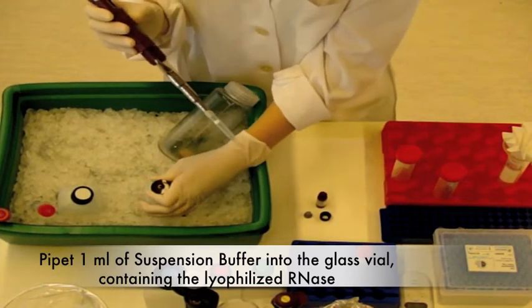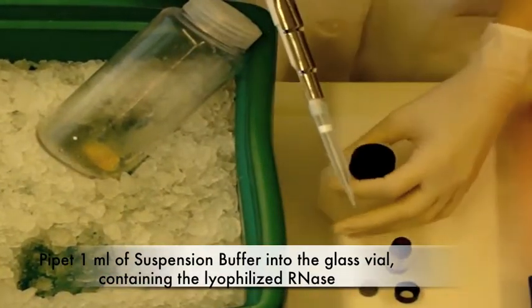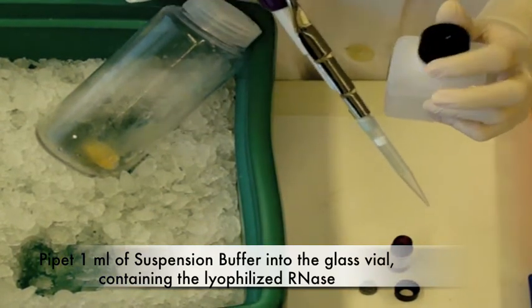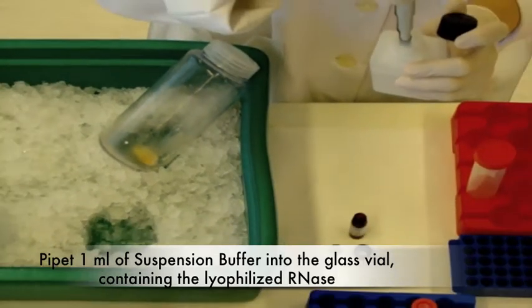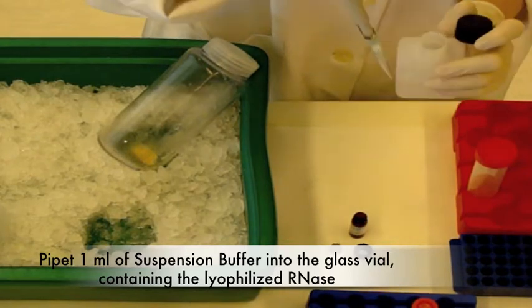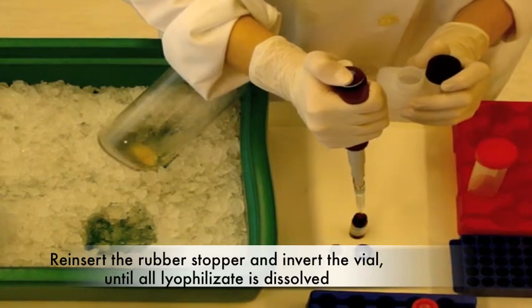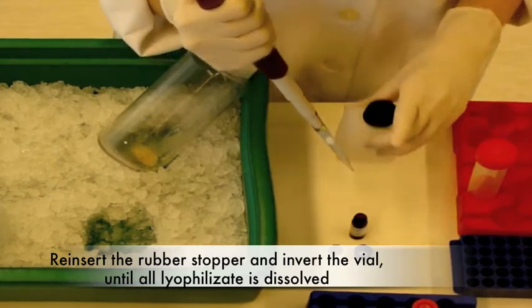Pipet 1 milliliter of suspension buffer into the glass vial which contains the lyophilized RNase. Close the vial and mix it well until all lyophilized material is dissolved.